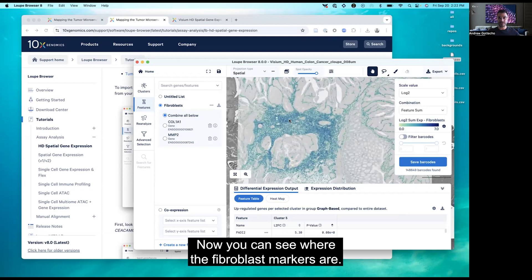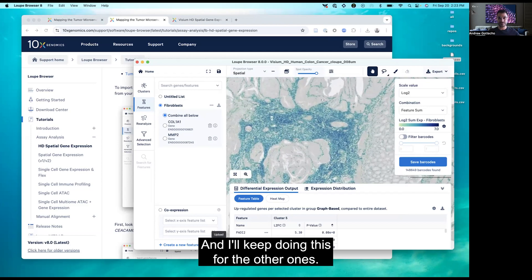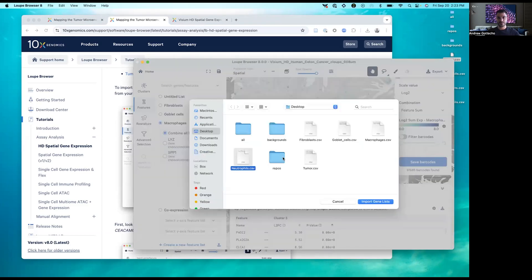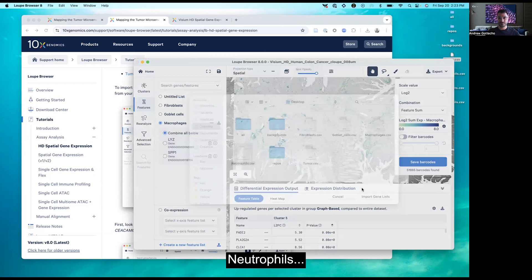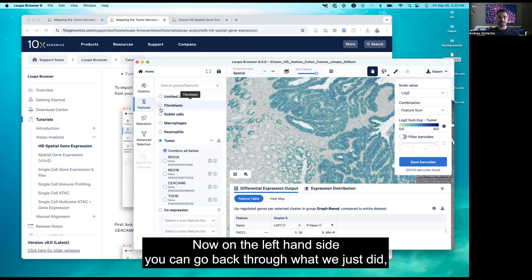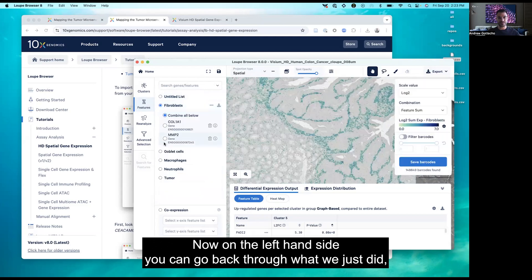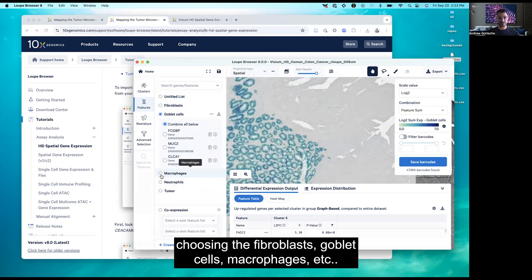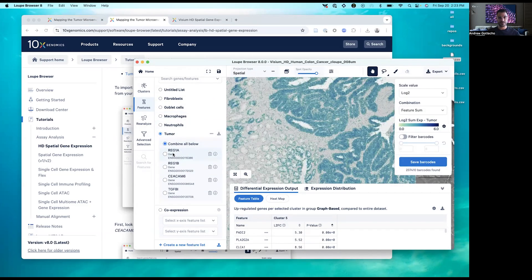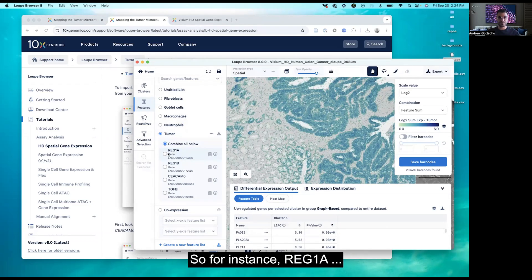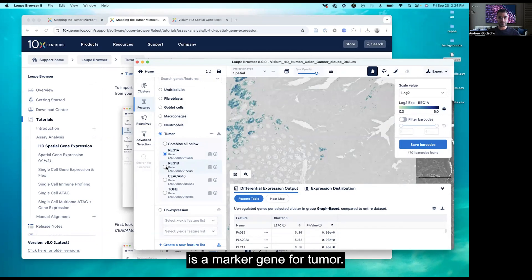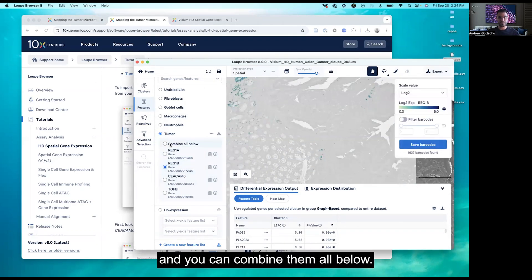Now you can see where the Fibroblast markers are. I'll keep loading the other cell types: macrophages, neutrophils, and the tumor. On the left-hand side you can go back through each one — Fibroblast, goblet cells, macrophages, etc. Within each you can see the different marker genes. For instance, REG1A is a marker gene for tumor, and you can combine all of these together.